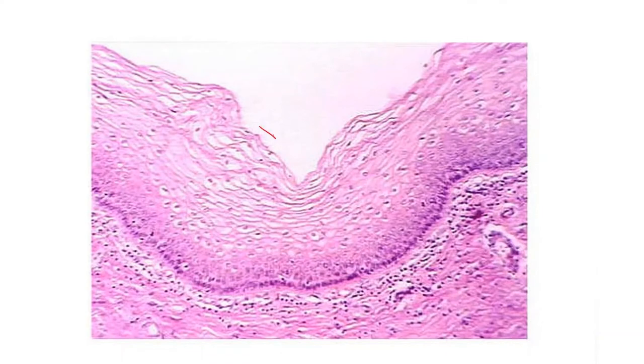Here again, from top to the dark line, many layers of cells, boxy at the bottom, flatter and flatter as we approach the top. I got an apical surface, I've got a nice distinct basement and connective tissue underneath. So this is stratified squamous epithelium. Function, protection. Location, the skin, or say the esophagus, something like that.